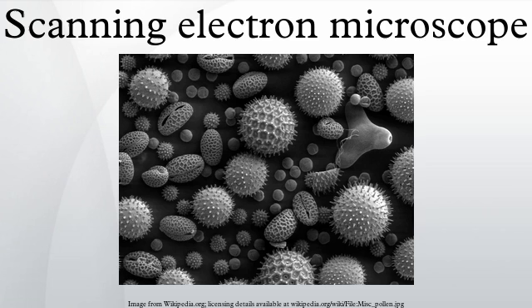Fixation is usually performed by incubation in a solution of a buffered chemical fixative, such as glutaraldehyde, sometimes in combination with formaldehyde and other fixatives, and optionally followed by post-fixation with osmium tetroxide. The fixed tissue is then dehydrated. Because air drying causes collapse and shrinkage, this is commonly achieved by replacement of water in the cells with organic solvents such as ethanol or acetone, and replacement of these solvents in turn with a transitional fluid such as liquid carbon dioxide by critical point drying.